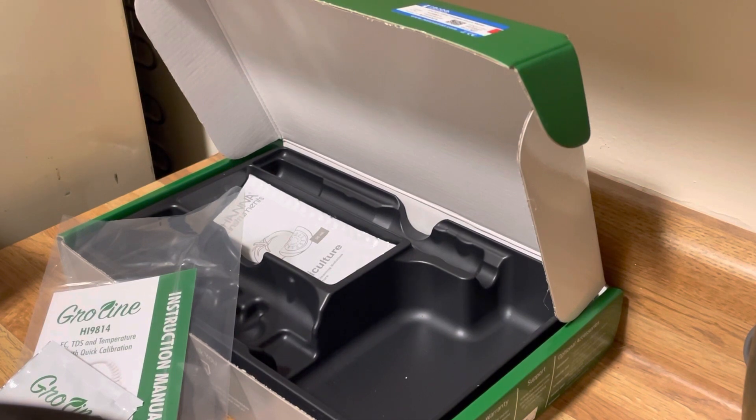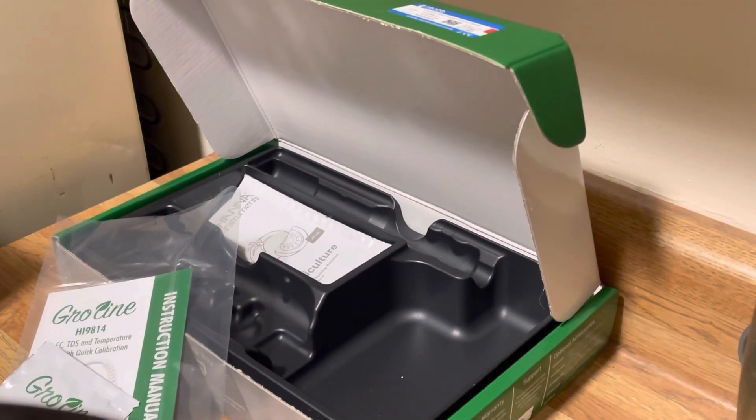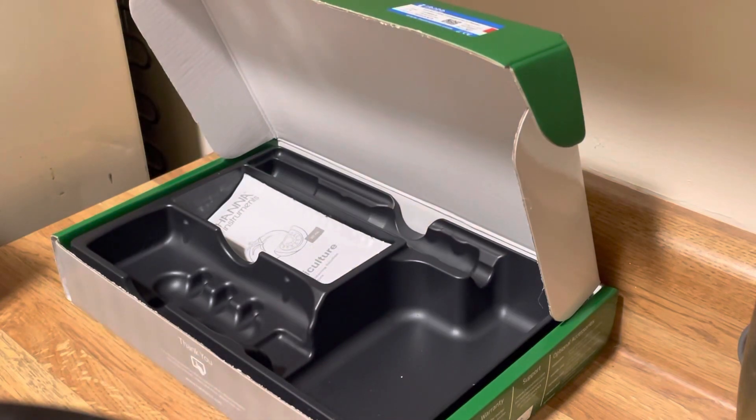Rinsing off the probe right now. It's important to use clean RO water so you get good calibrations and readings. We've got our probe right here, we've got the device in hand — let me just check what this manual says real quick. Let's calibrate.